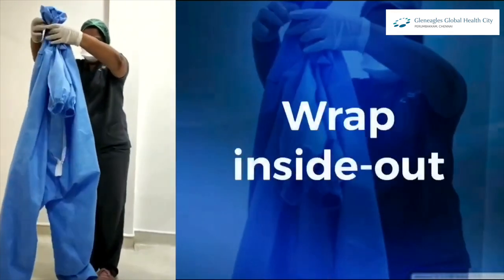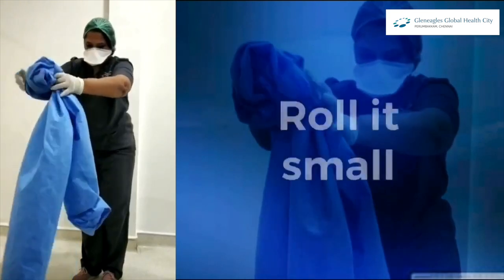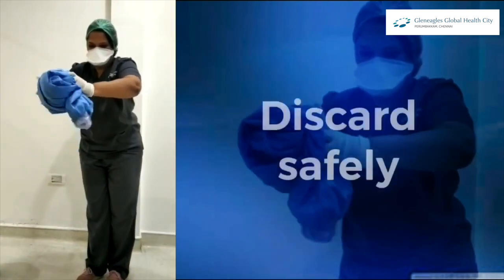Now wrap the suit inside out, keeping the suit away from your body, and roll it as small as possible, then discard.